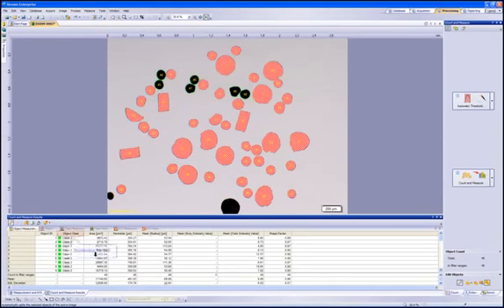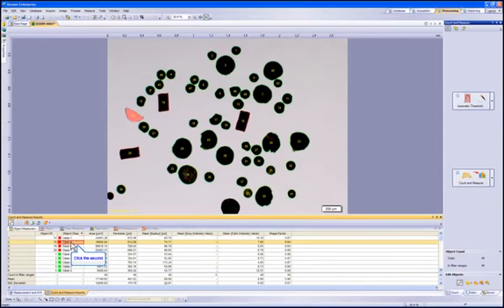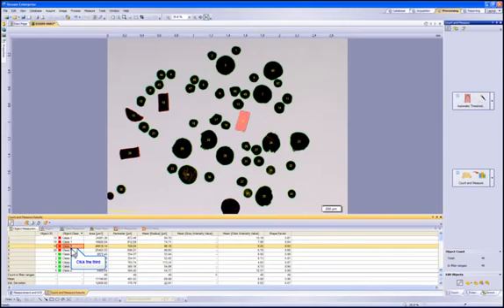Once it has performed any changes, those will be shown as new separated particles, and again the object measurement list was updated. By double-clicking on the Object Class field, we can sort the two classes generated, allowing us to easily show the different particles. Let's click through the particles listed in Class 1. This class has separated the particles by their shape factor. This is the first class. This is the second in the list. As you can see, this is a broken particle and we will need to remove this particle entirely from our evaluation. This is the third in the list and the final particle in Class 1.